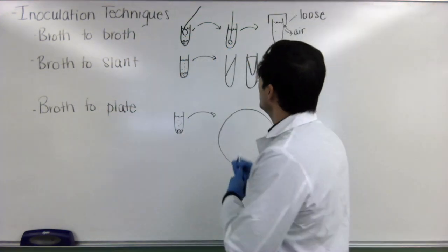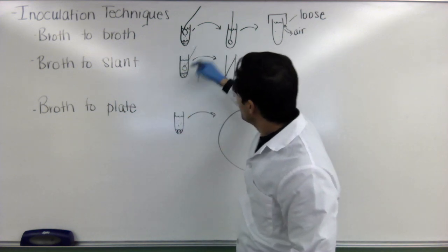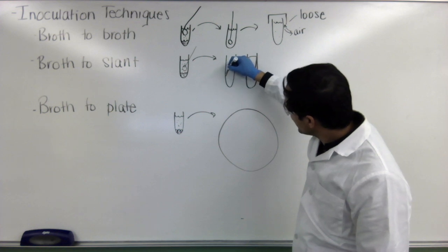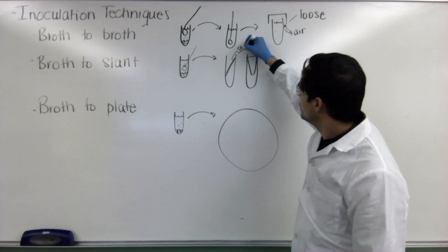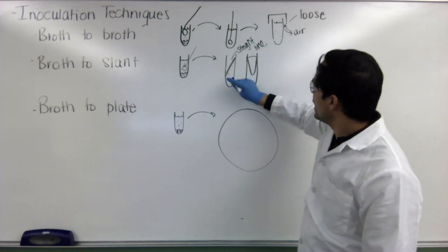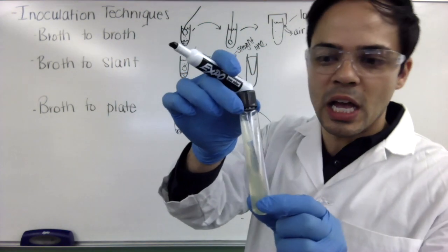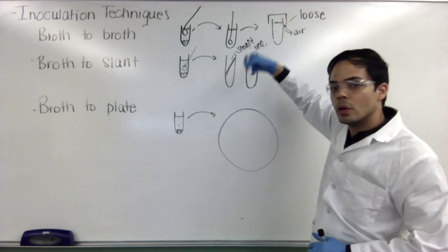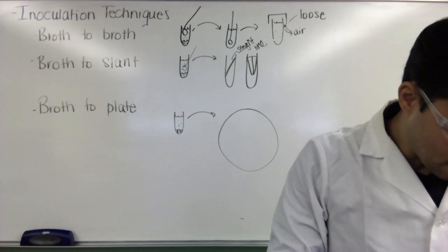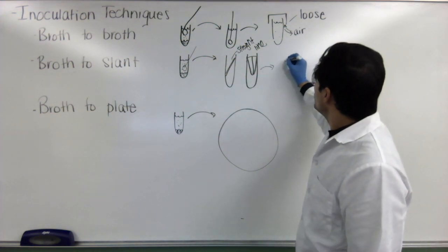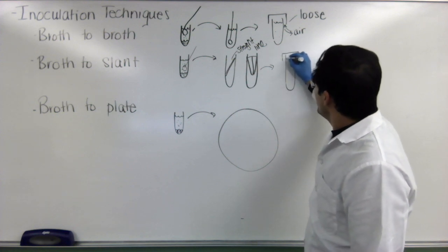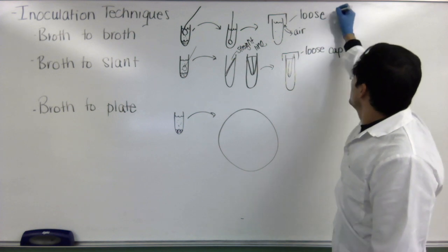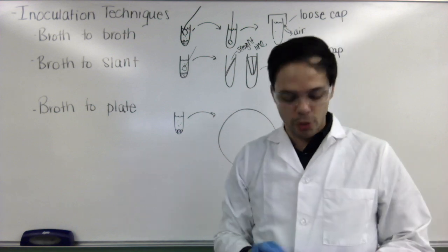What we're going to do is go from a broth culture and transfer it to this nutrient agar slant. Using aseptic technique, go into the tube with your inoculation loop and transfer some bacteria. To inoculate the slant, make a straight line on the surface of the slanted portion. Looking at it from the front, start at one end and drag your inoculation loop up or down to make a line. Once you're done, put the cap on — make sure there's a loose cap so that air can get in and out, allowing the bacteria to respire as they're growing.